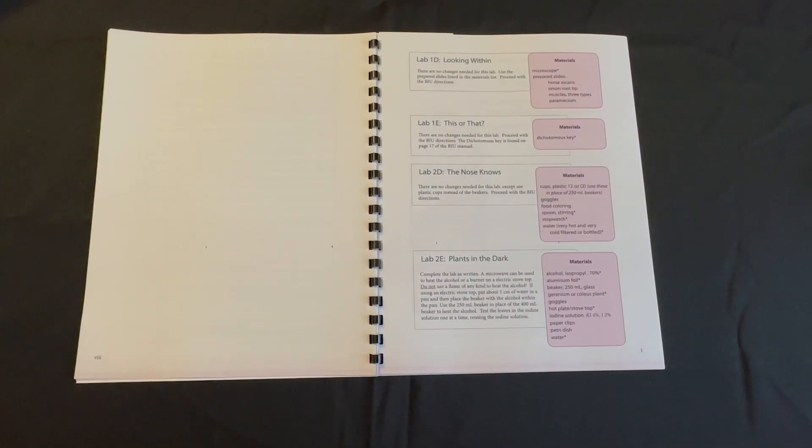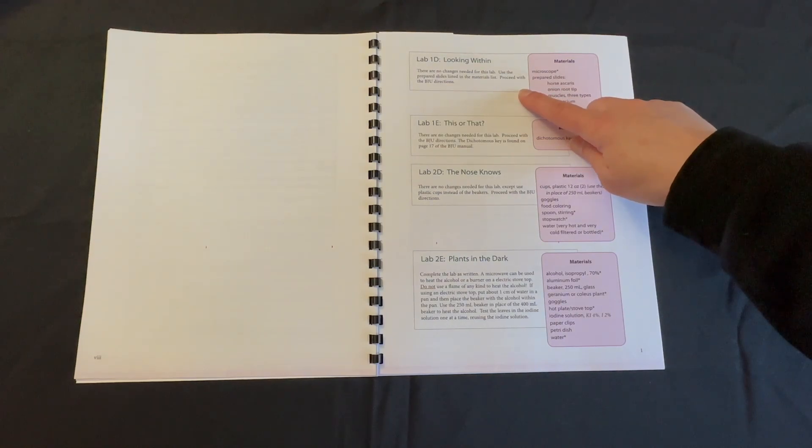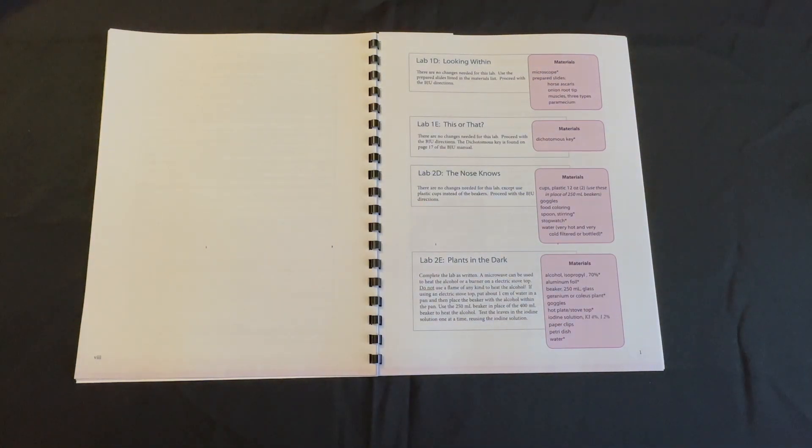As you continue through your addendum, each lab will be listed with materials needed as well as any additional instructions if there are any. Any materials with an asterisk next to them are materials that you will need to provide.